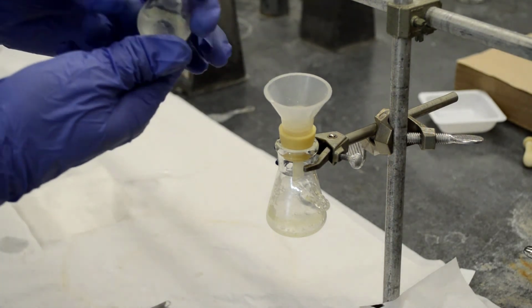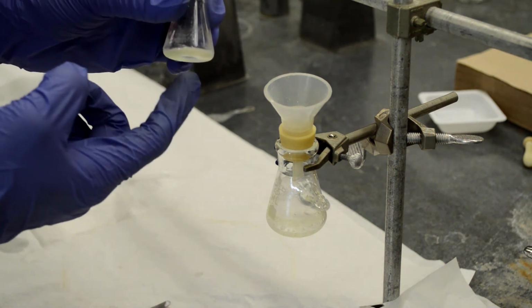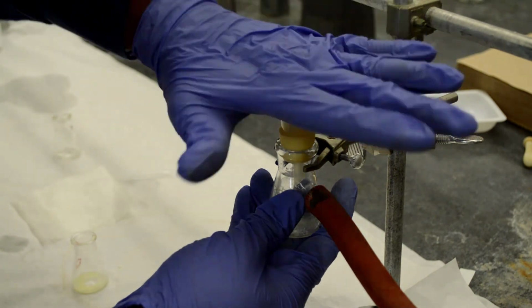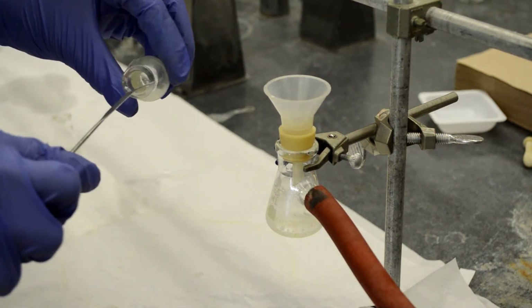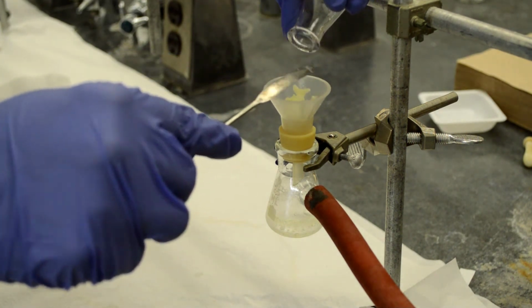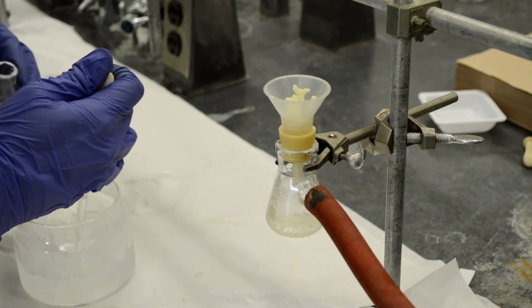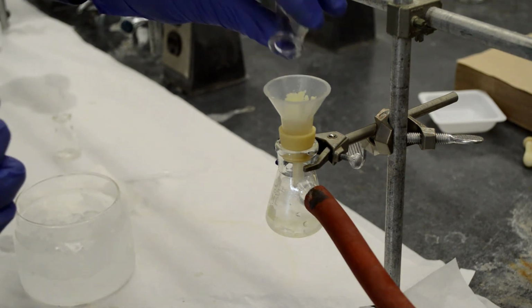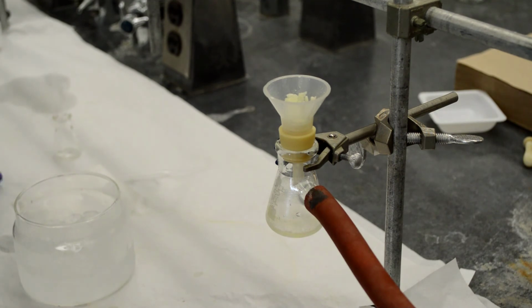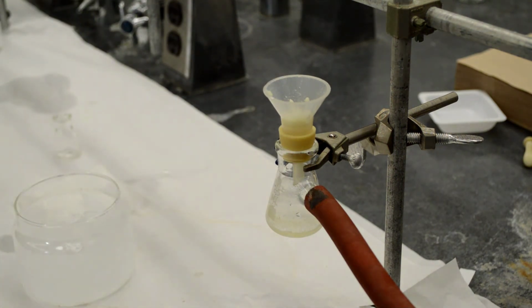Okay, so this is from the ice bath. You can see the crystals. That's a pure product. So we're going to filter the crystals using vacuum filtration. Turn on the water, check the vacuum, and transfer your crystals. Okay, let's dry the crystals.